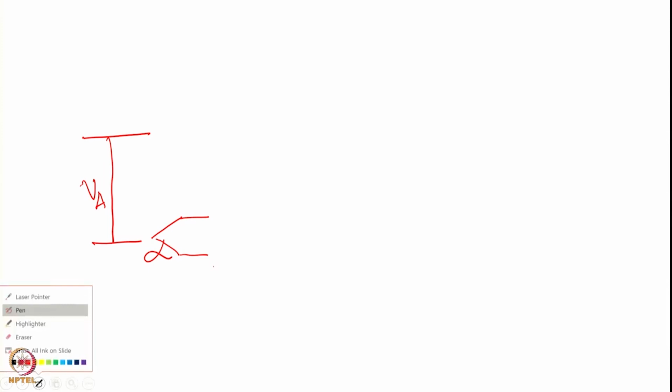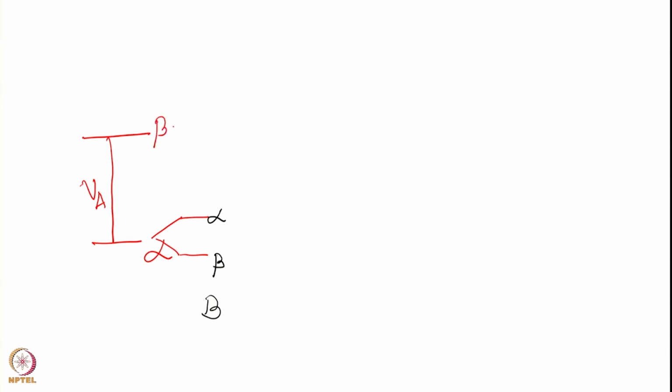If this is beta, this will be down in energy because these are opposite orientations, and this is alpha here, this is the orientation of the other spin, this is the beta spin orientation. So, therefore, these two have different energies. Obviously, instead of one line coming here, there will be 2 lines coming there. If I call this the beta state, here again it is split into 2.